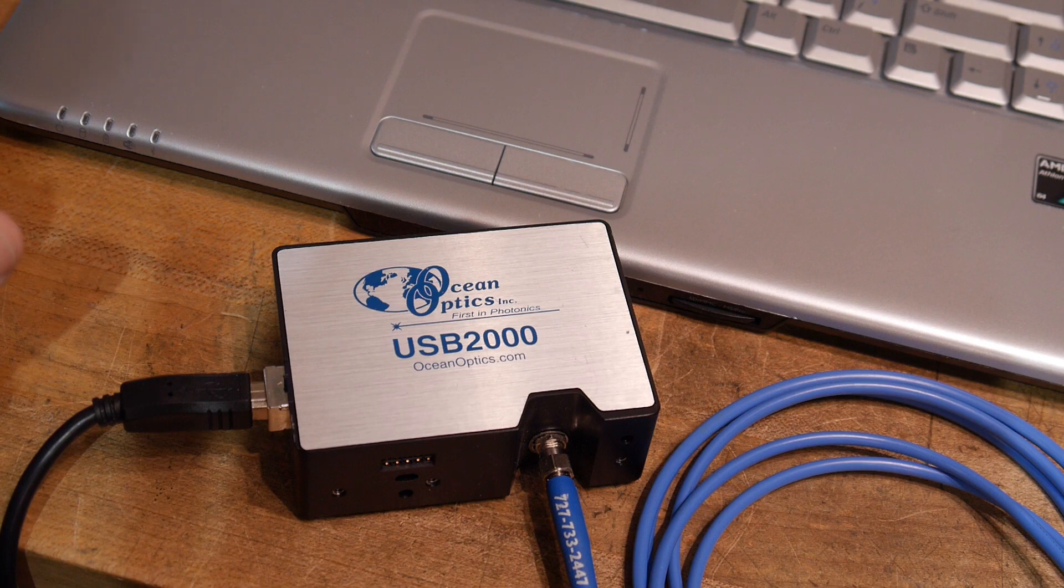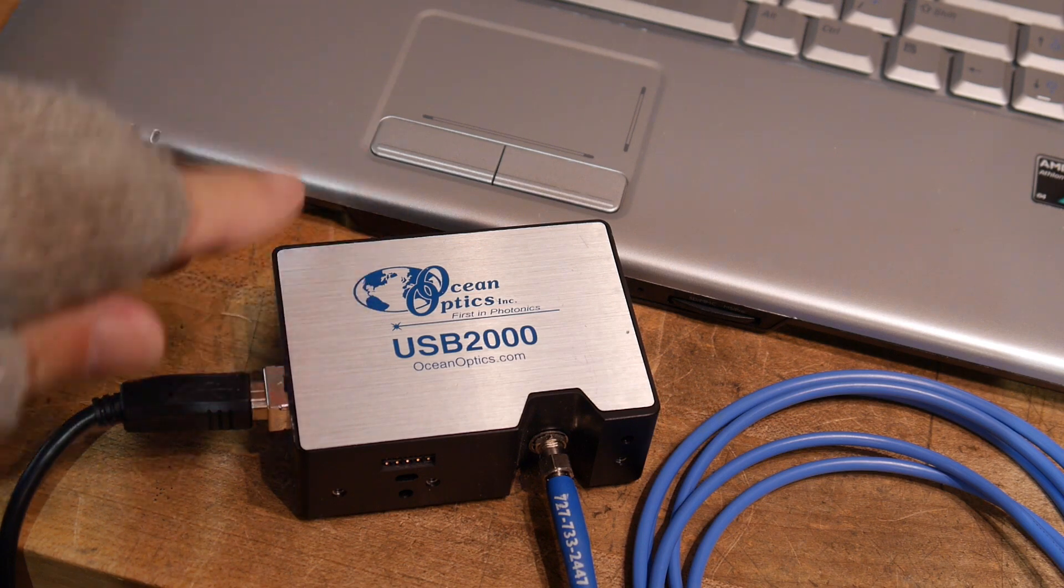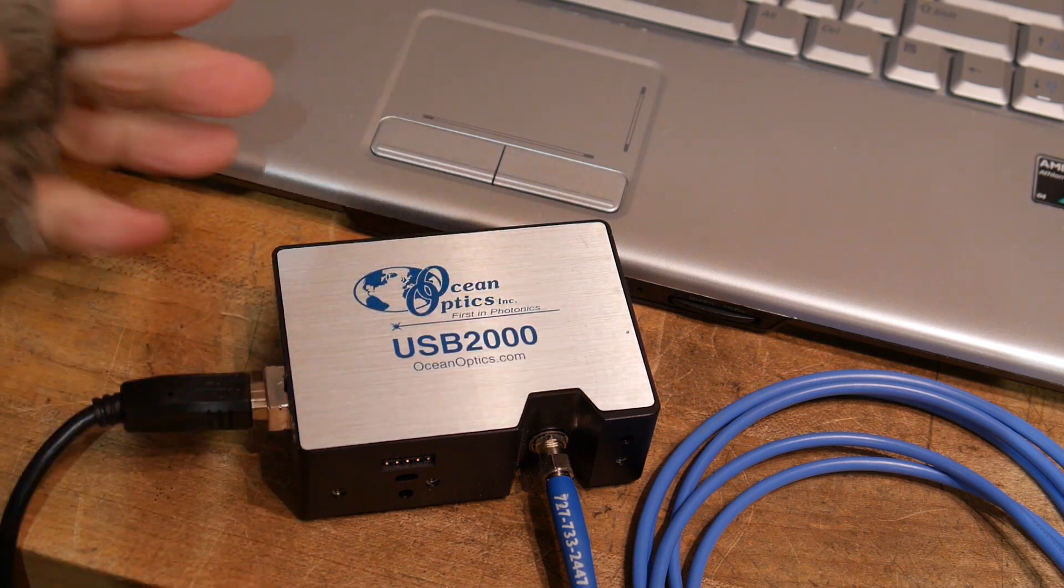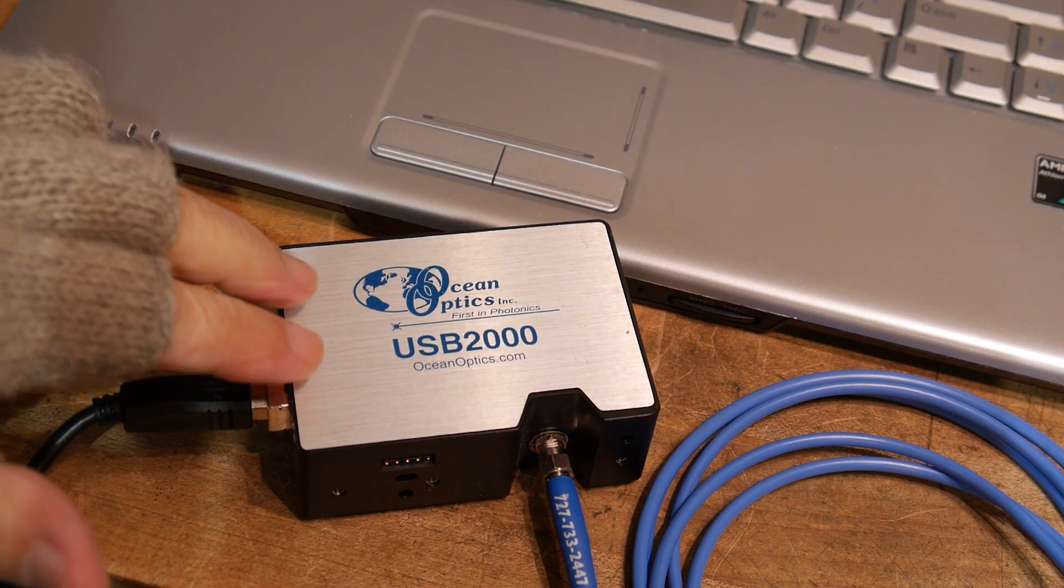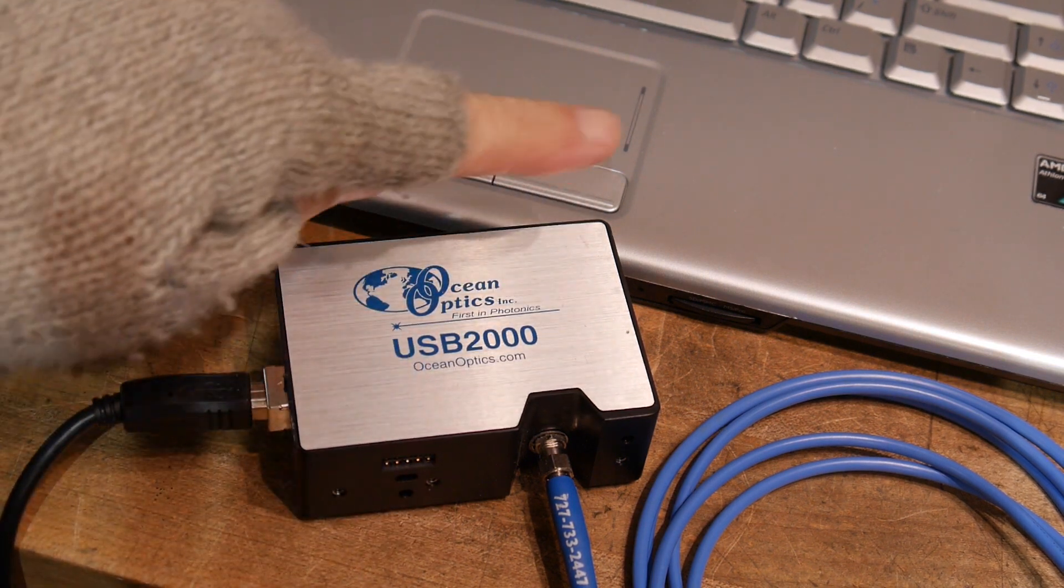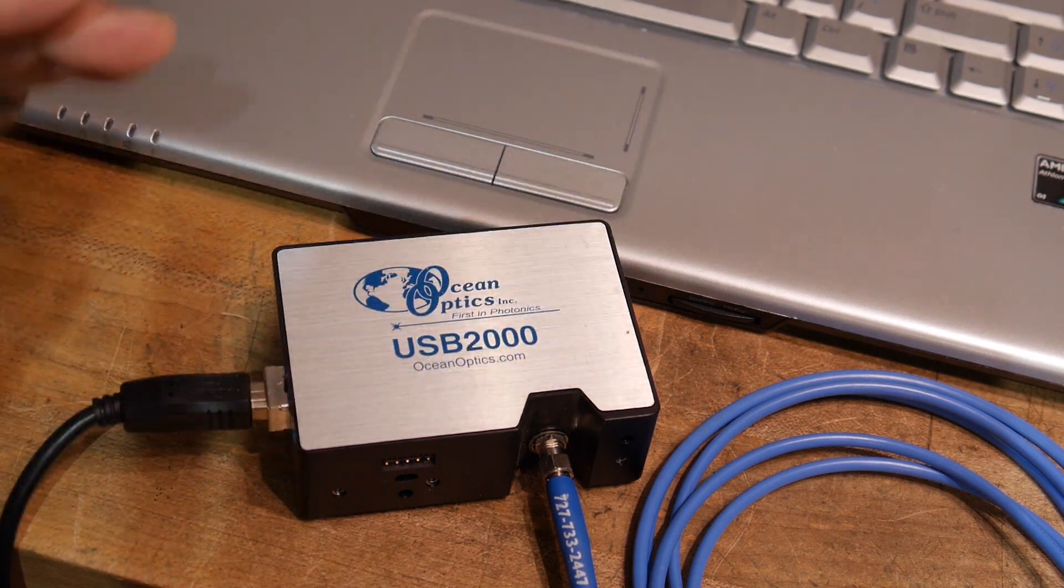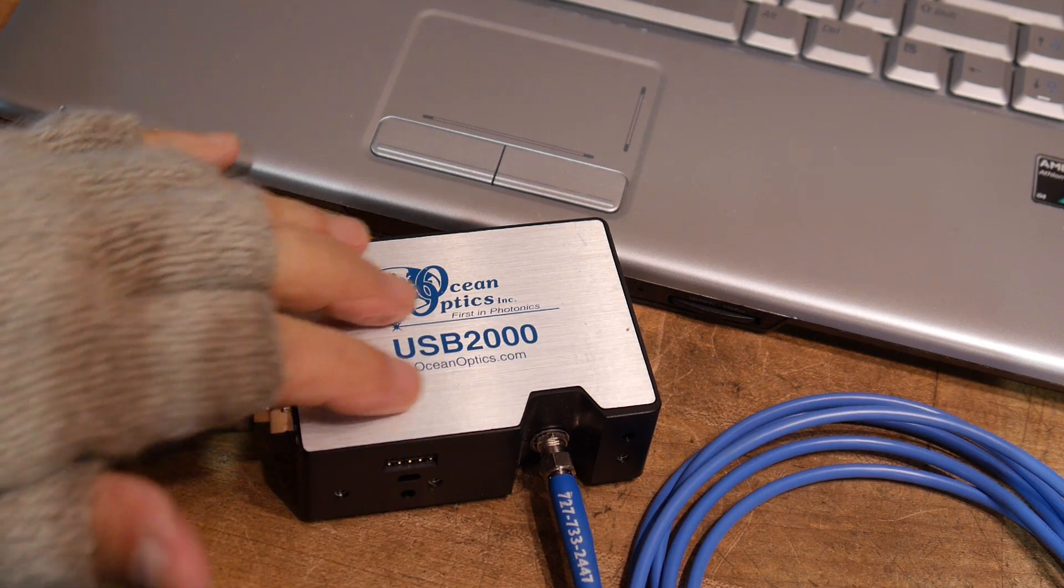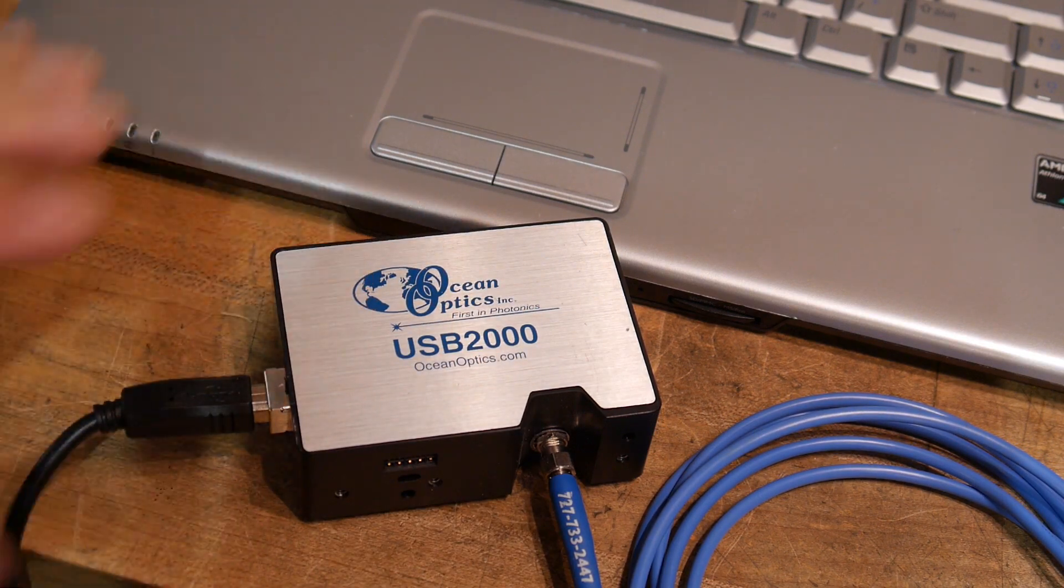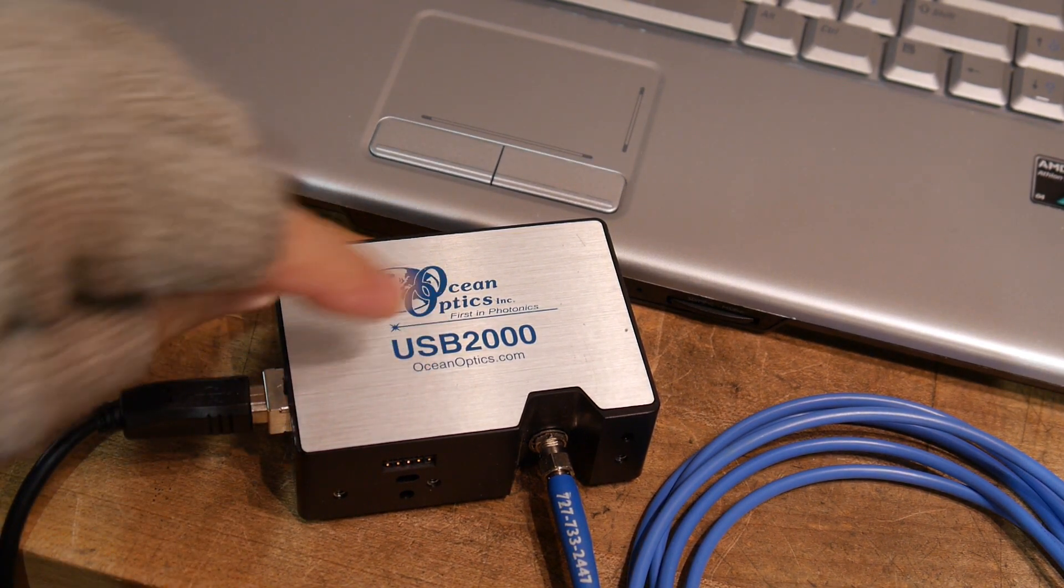We saw that in the monochrometer. With the other spectrophotometer we could rotate the diffraction grating so we could select what color comes out the other side. What this does is it takes that rainbow and puts it onto a CCD, so the CCD gets to look at that rainbow and break it up into a thousand different points and it gets to output the rainbow. You get to see real time what the fiber optic looks at, so we can look at the spectrum of light sources. It's a USB device, that's why it's called the USB 2000.